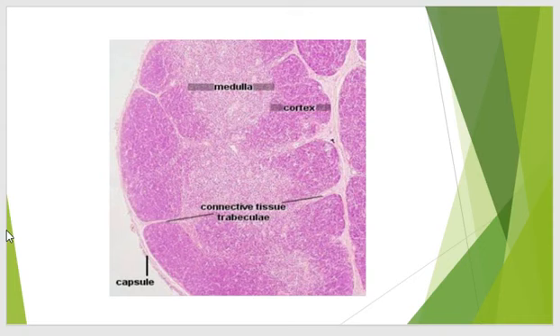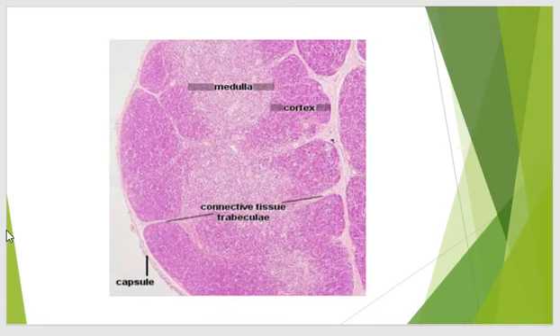Looking at the microscopic structure of the thymus, we can see the connective tissue capsule surrounding the thymus. From this capsule, trabeculae or septa arise and divide the thymus into incomplete or indistinct compartments or lobules. The outer portion is basophilic due to the large number of T lymphocytes, whereas the central medulla stains lighter because it contains fewer T lymphocytes compared to the cortex.